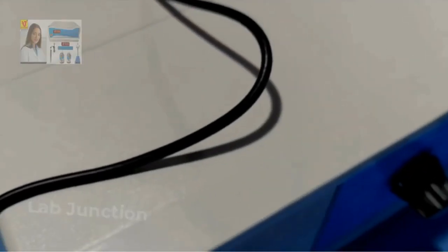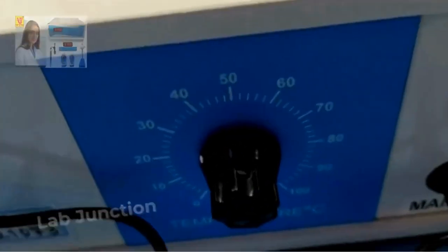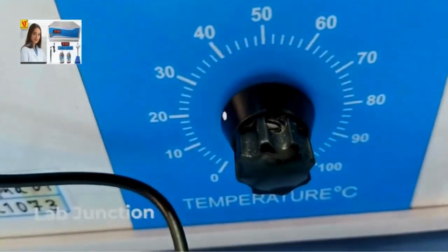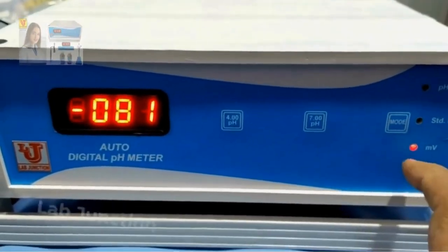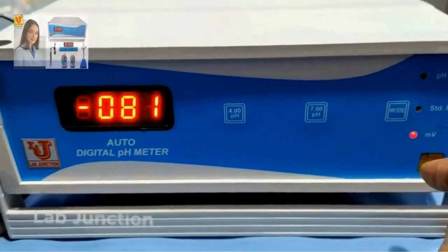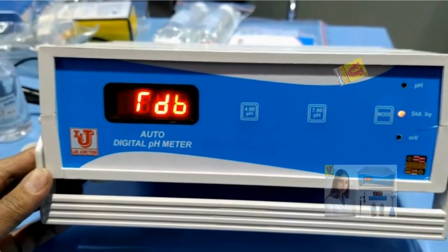First of all, you have to set the temperature — default is 25 degrees, set from the back side of the instrument. These are the keys: this is the mode key. If you press it, it goes to pH mode. Press again, it goes to millivolt. Press again, it goes to ORP — oxidation reduction potential. Press again, it goes to standby.